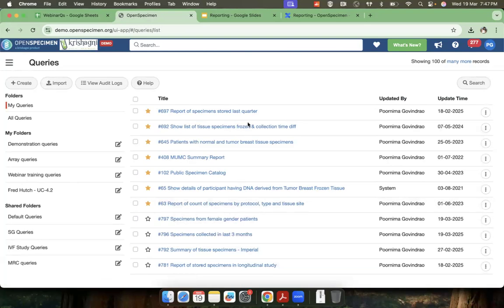I'll just quickly see if there are any questions. What is the calculated filter on the query page? We'll come to that. We'll be showing the user. Okay, Sneha is taking care of the questions.